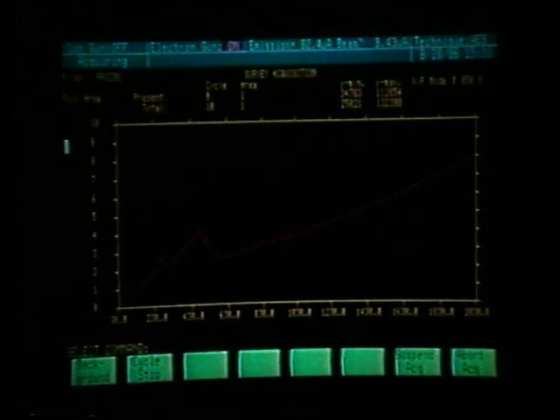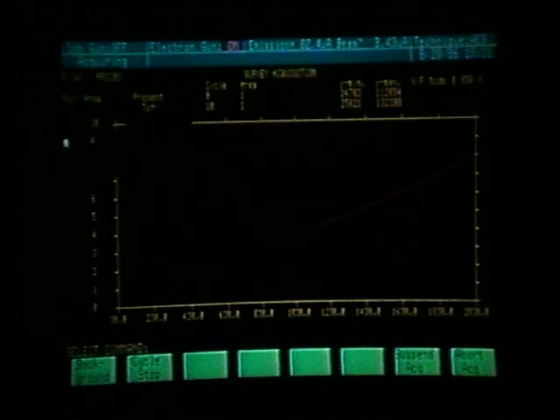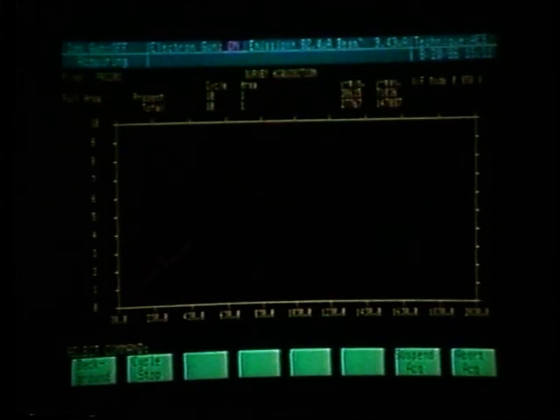We are now presently on cycle number 10 of 10, meaning this is our last cycle. When this survey scan is finished, what we will do is display and differentiate in order to evaluate what elements are present and what elements we wish to include in the profile.